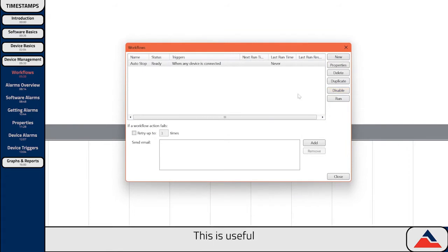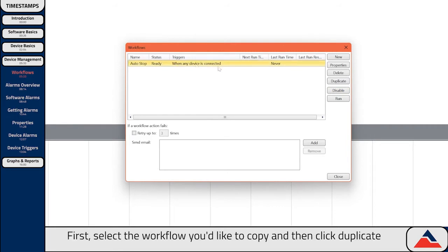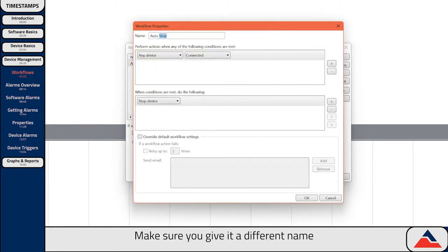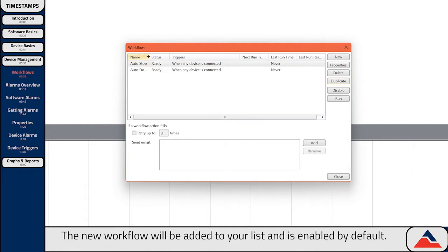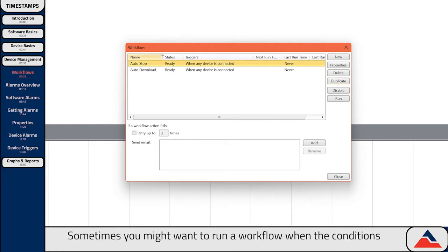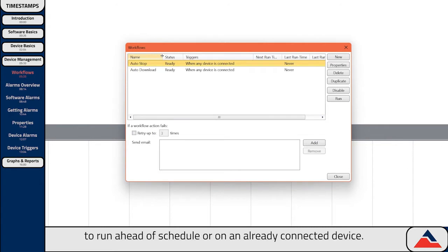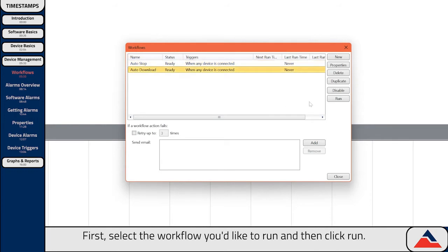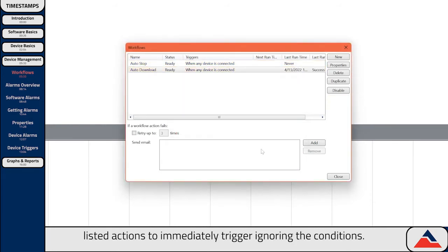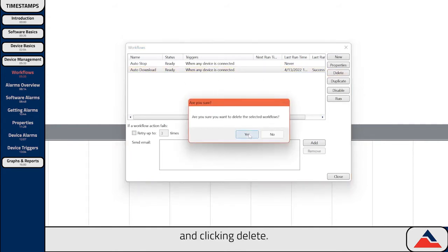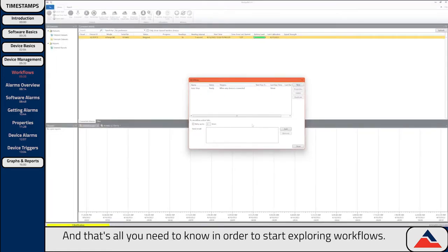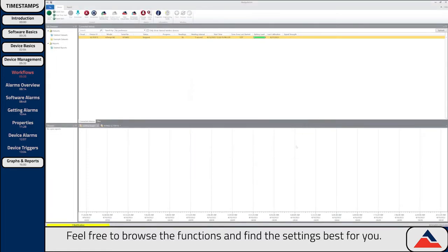You can also duplicate a workflow. This is useful if you'd like to create multiple workflows with small adjustments between them. First select the workflow you'd like to copy, and then click Duplicate. Make sure you give it a different name, and then make adjustments as needed, and click OK. The new workflow will be added to your list and is enabled by default. Sometimes you might want to run a workflow when the conditions haven't been met, either to run it ahead of schedule, or on an already connected device. First select the workflow you'd like to run, and then click Run. This will cause the workflow's listed actions to immediately trigger, ignoring the conditions. And if you'd like to delete a workflow, you can do so by selecting it and clicking Delete.